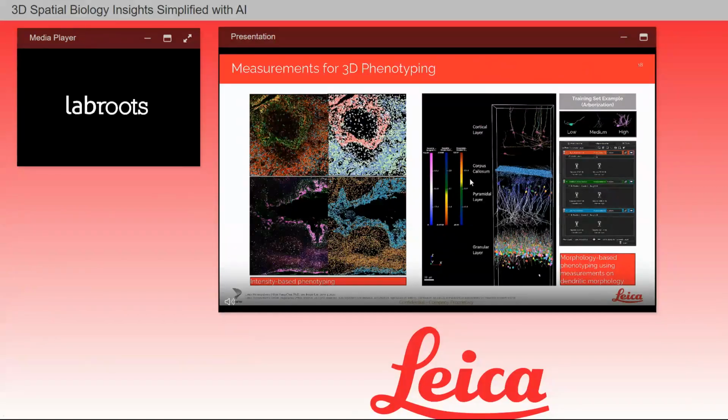In addition to the types of classifiers for phenotyping, we have different types of measurements users can use for phenotyping. We use intensity-based phenotyping in 3D, as you see here on the left-hand side, where cells are segmented first, here in the two images right here, and phenotyped using intensity measurements. On the right-hand side, we see an image, not a multiplex image, but a traditional confocal image that we created for our poster at Society for Neuroscience last year. This is an example of purely morphology-based phenotyping in 3D.